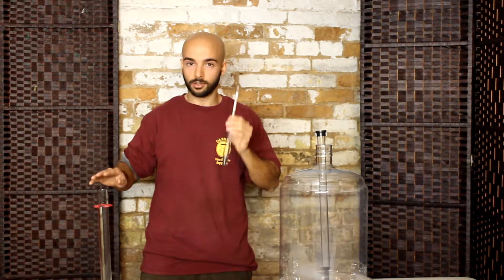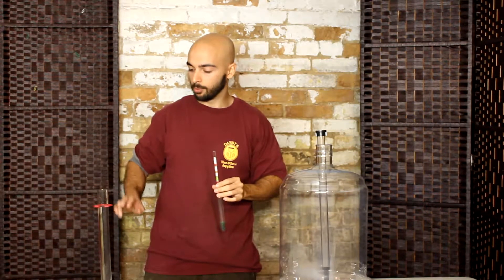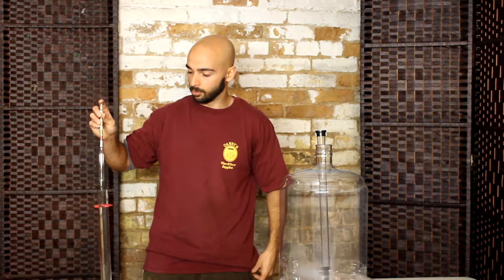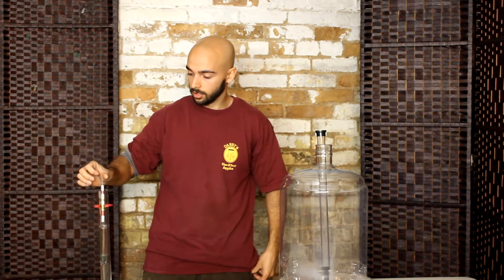Whenever you're using your hydrometer, you're going to want to make sure that the container you have is filled up with enough of your sample — about 80% full. Then to use your hydrometer you're simply going to place it into the sample and give it a gentle spin when you put it in. This will stop bubbles from forming on the bottom of the glass, which will affect your reading.